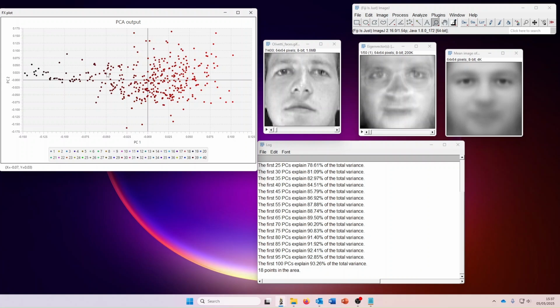We can see that the color gradient goes from black to red. In the current version, I've just set it to a single color gradient, always black to red, and it automatically determines the dynamic range from the maximum intensity on an 8-bit scale to the minimum intensity on an 8-bit scale, irrespective of the absolute values originally. So obviously the absolute values here are 0.1 to minus 0.15, but this is scaled from 0 to 255, which is the 8-bit range.